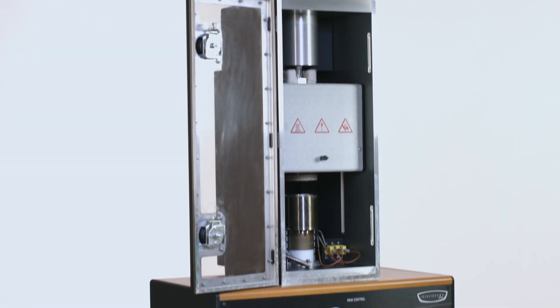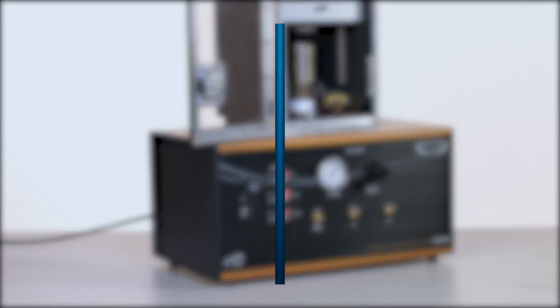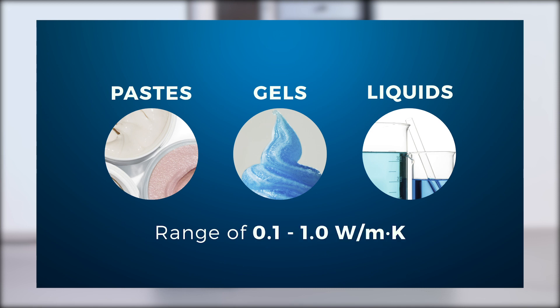The DTC-300 can be used to measure the thermal conductivity of non-solid samples. Available as an additional accessory, pastes, gels, and liquids in the range of 0.1 to 1.0 watts per meter Kelvin can be measured in the instrument.